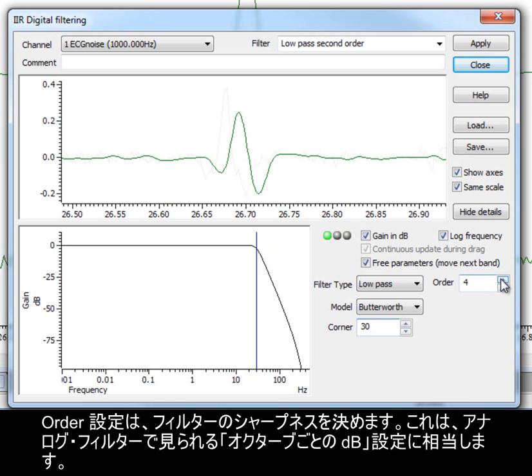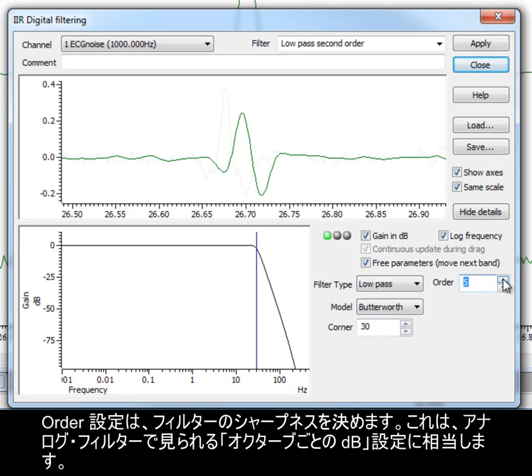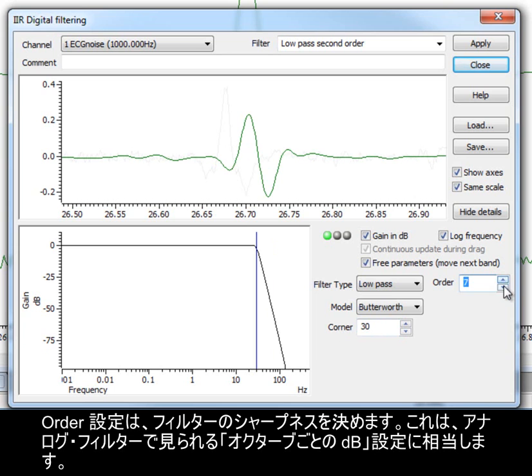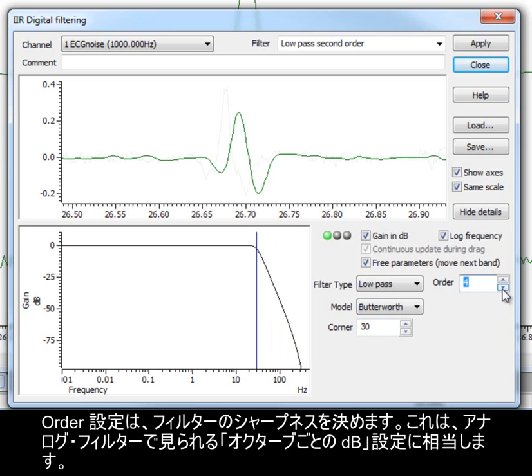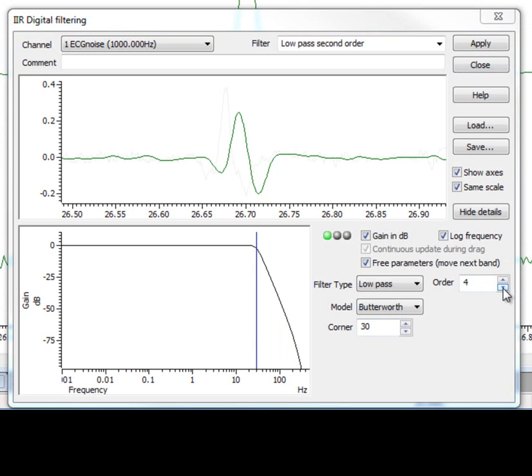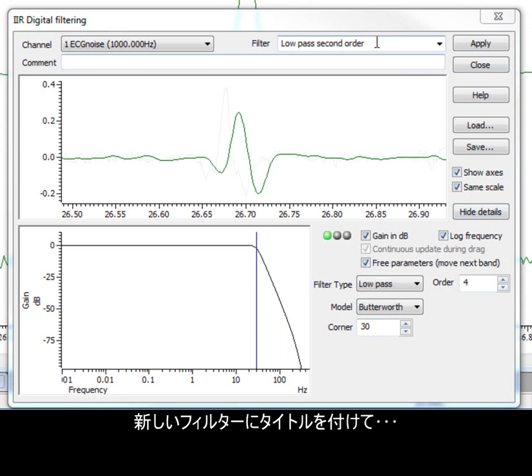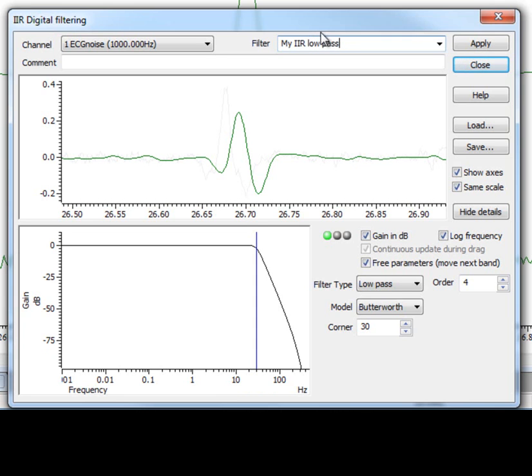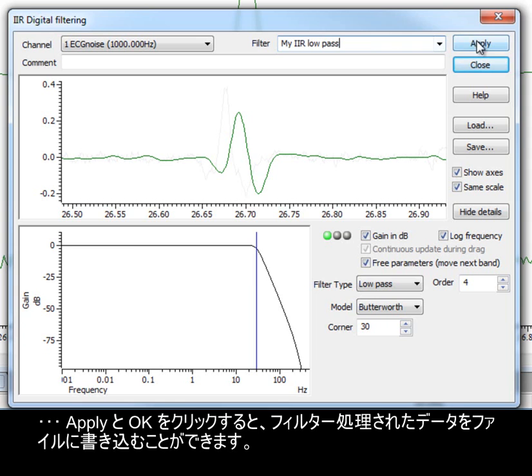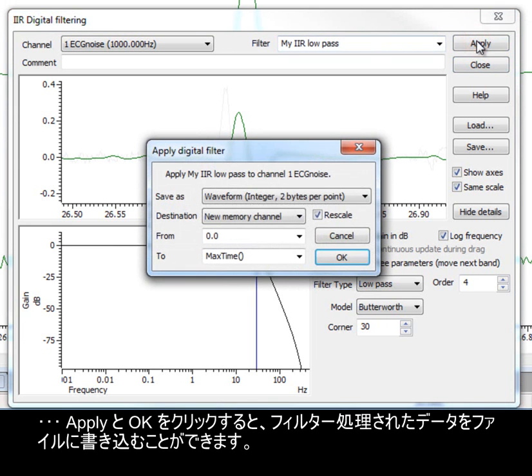The order setting determines the sharpness of the filter. This is equivalent to the dB per octave setting seen with analog filters. We can give our new filter a title, and then click Apply and OK to write the filtered data to our file.